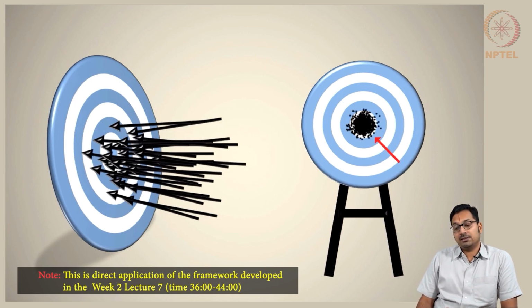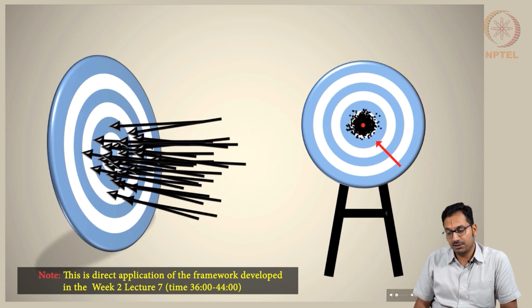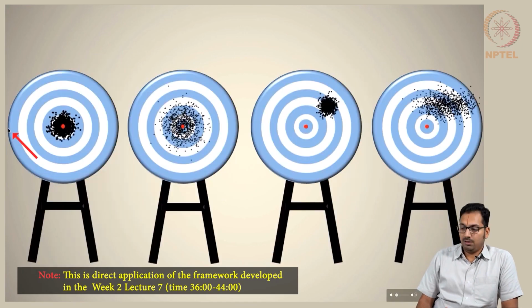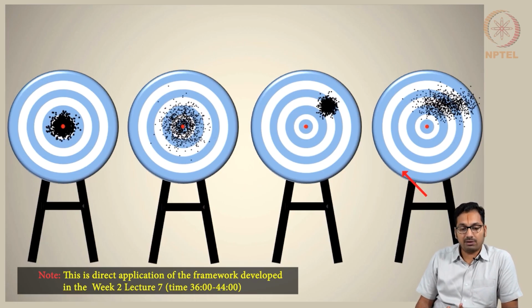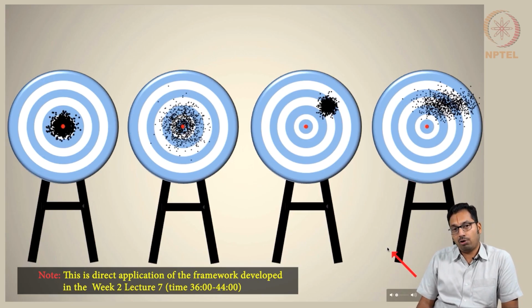And the average and the standard deviation, which help us understand accuracy, would be given as a dot in the center with bars that help you understand what the standard deviation is. And let us say these are the 4 different measurements that we end up having. We had already seen this during the lecture, which gives you better accuracy and which gives you better precision. As a scientist, if you are calibrating the burette, you want to ensure that if you are adding 2 ml, you exactly want to add only 2 ml and not more or less.